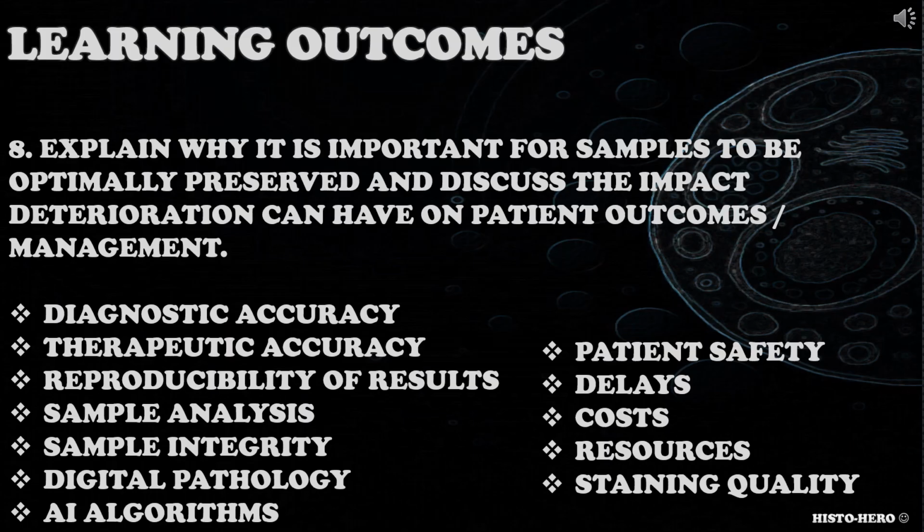Consider over and under fixation, structural damage, cellular degradation, compromised sample analysis, artifacts, weak or inaccurate staining, misinterpretation, unreportable sample, misdiagnosis, digital pathology and AI algorithms, patient safety, delays, costs, resources and so on.